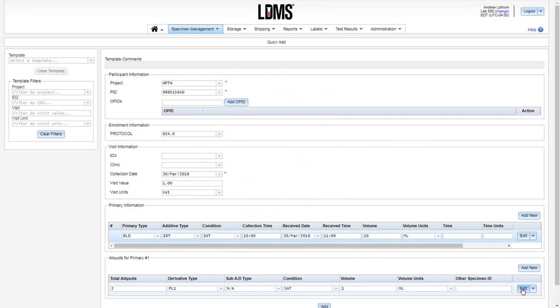The aliquots also have their own edit menu as well. If you do not have processing information at this time, review our video on the use of filters and the addition of post-processing information to the specimen record in specimen management.